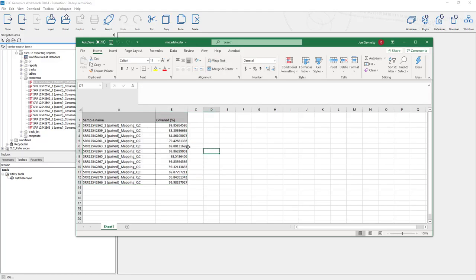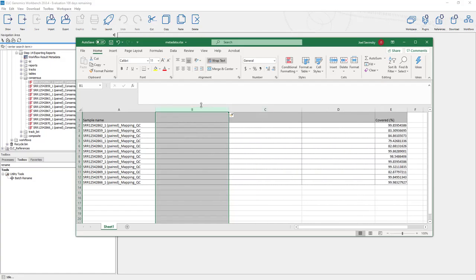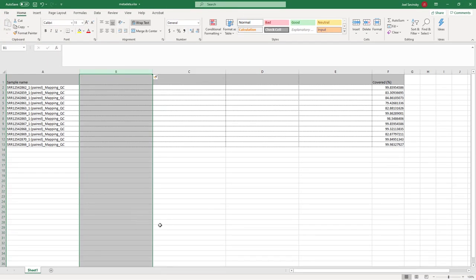Okay. Now, I'm going to show some manipulations in Excel here, and I don't have an easier way of doing this, a little manual work here. Hopefully in the future I can update this video and show some better practices. But for now, I'm just going to show you the way that I would do it with the tools that I have now. So I'm going to make a little bit of room here where I'm going to insert a couple of files because I want to modify the identifier here and make it very similar to what we used on our last renaming.